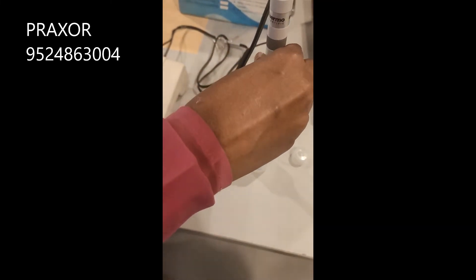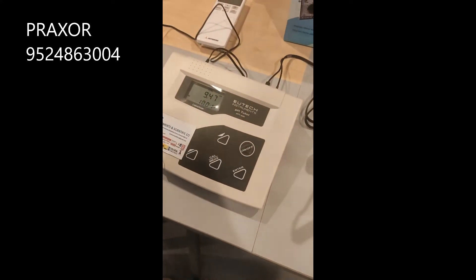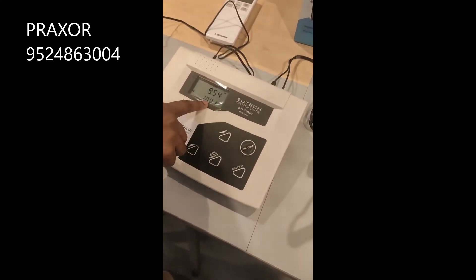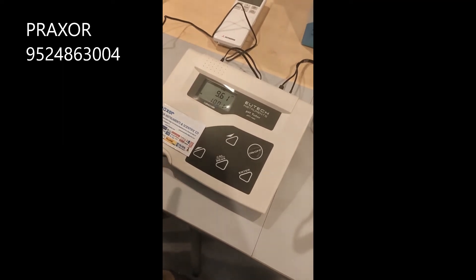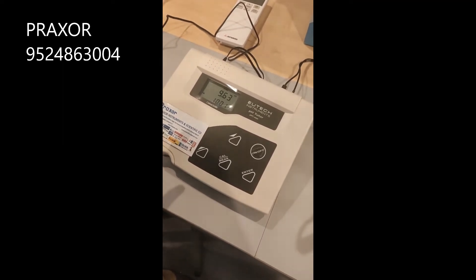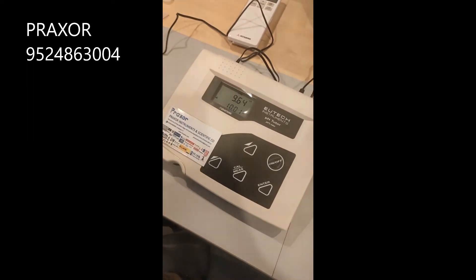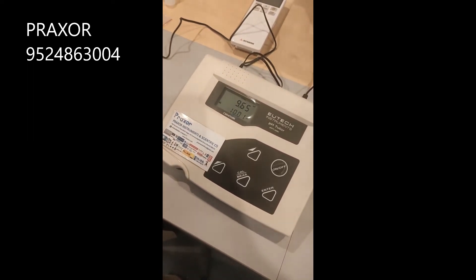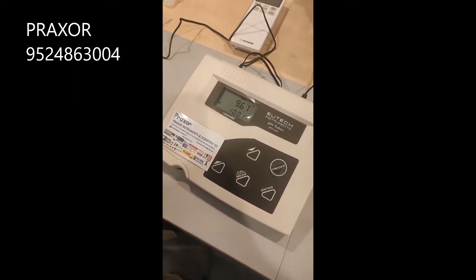Put the electrode in the next solution — the pH 10 solution. The lower display will log 10 pH. It is already in calibration mode, so the ready signal will appear on the left side corner. Once you get the ready signal, just press the Enter key.